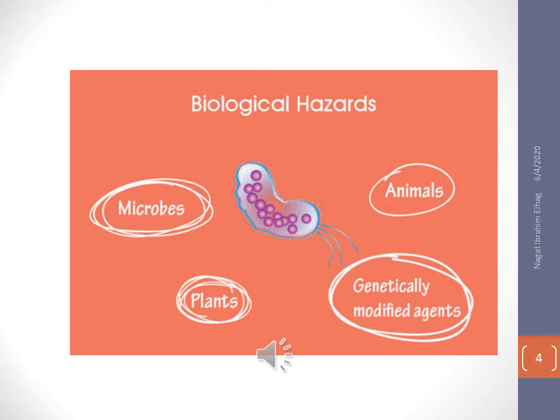So you make the lab very clean from those microbes, and make the lab workers safe while they are working in a microbiological lab.